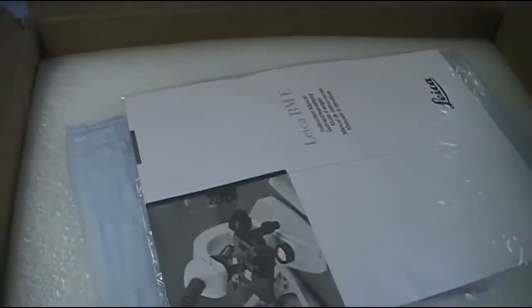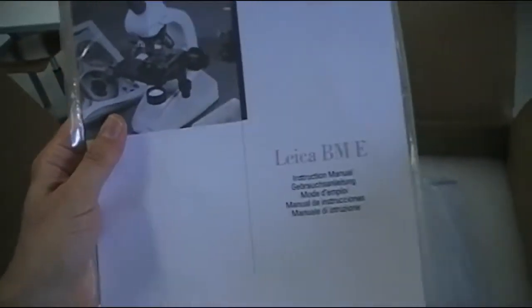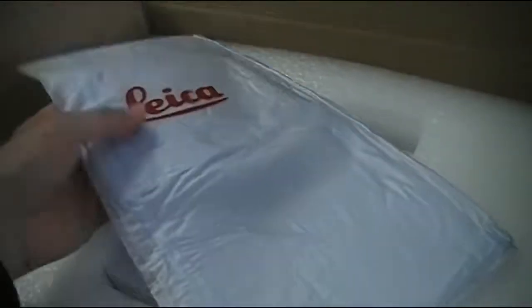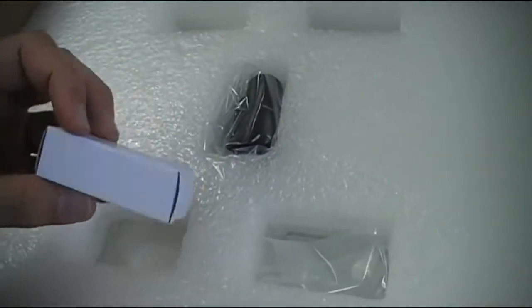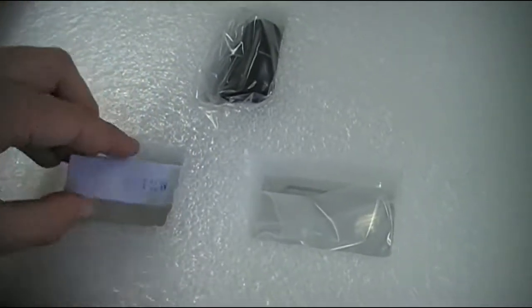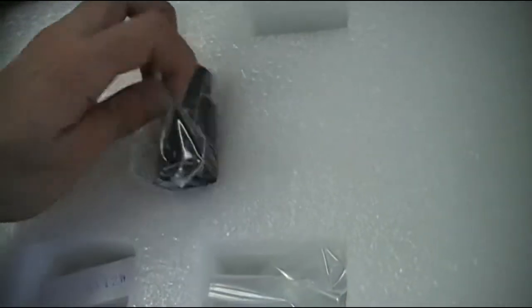Instruction manual over here — I better read this at home, let's put this to the side. This is a dust cover, and over here what do we have? This seems to be a replacement bulb — yep, 12 watt. There's a little tool, and over here this seems to be the eyepiece.